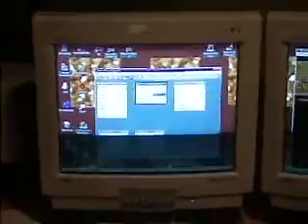Okay, feedback controls, we already talked about most of these. It's really only the top three that you will ever change. You may wish to write down the drive frequency and drive amplitude, although those are, of course, recorded in the computer file whenever you save an image.